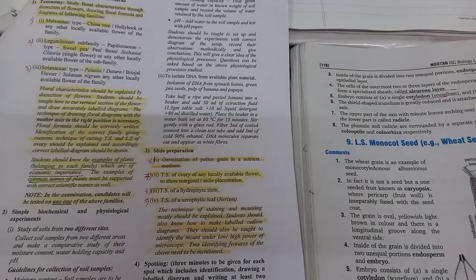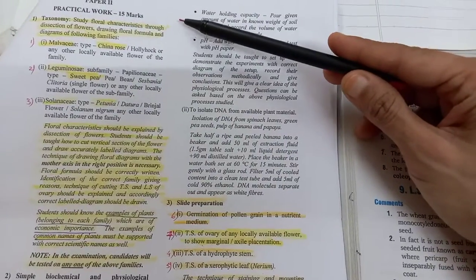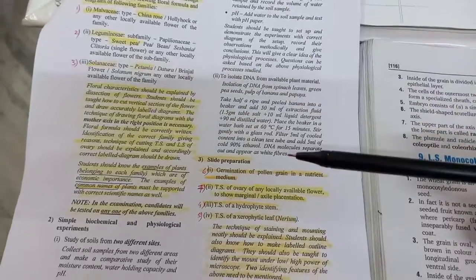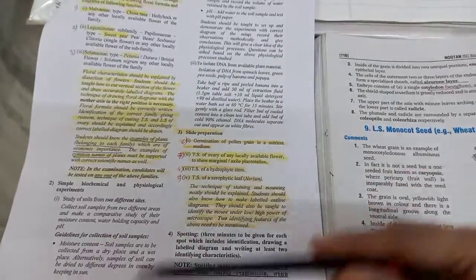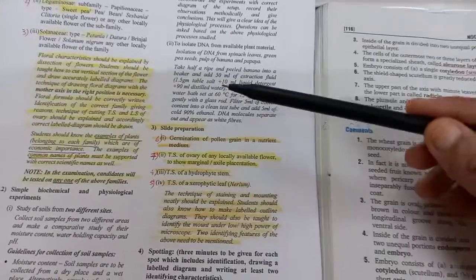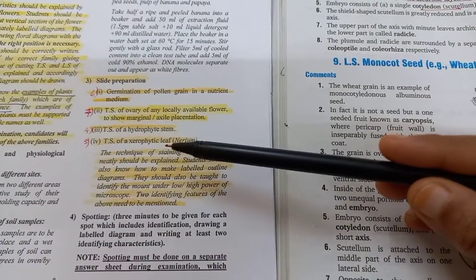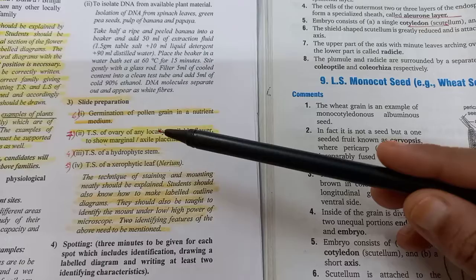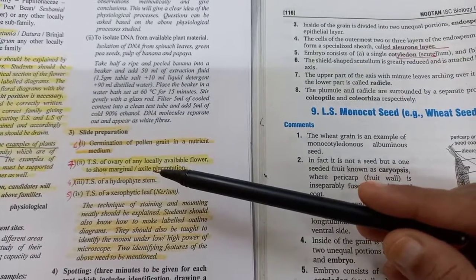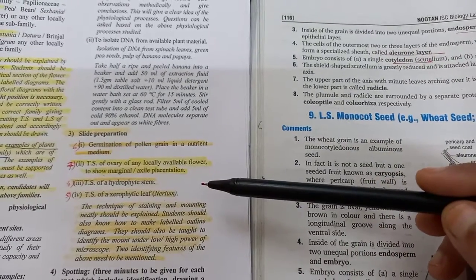Today we will do practical number 8, right? We have completed section A on taxonomy with the three flowers. After that, I have not started with section B, but I have started first with section C, which is on slide preparation. We have done the practicals on xerophytic leaf, TS of hydrophyte, germination of pollen grain, and the last practical was TS of a locally available flower to show marginal and axile placentations, right?